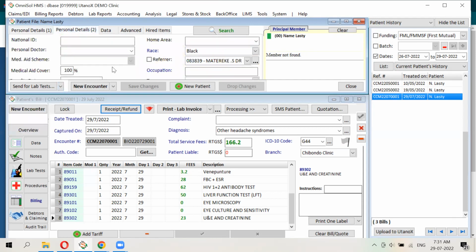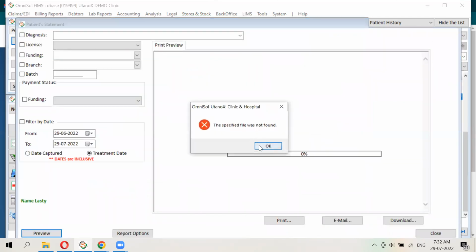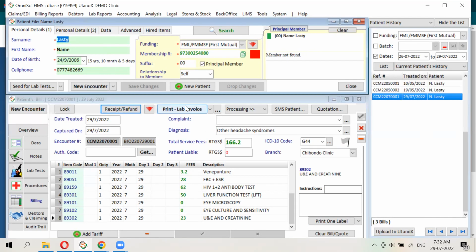Yes, it takes care of typical billing and accounting scenarios as well. And you can also view a statement of the patient's history as well. Oh, okay. Okay, that's all right. Then does it also show me doctor statistics?